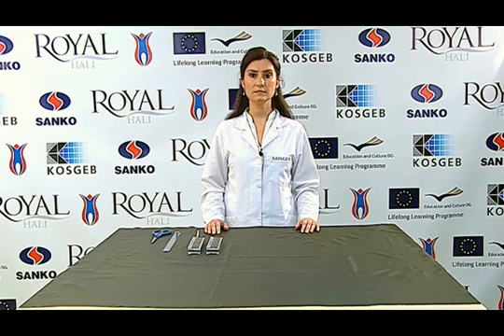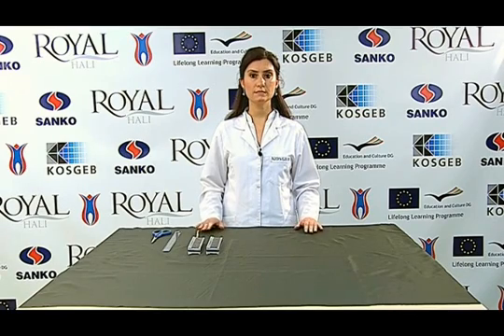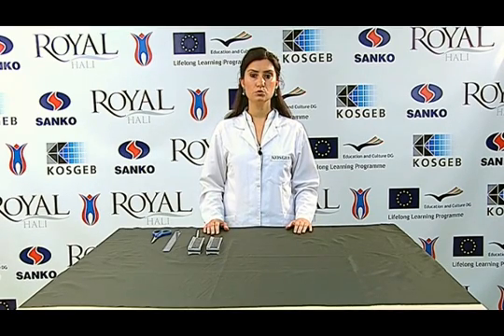First of all, test samples are conditioned under standard atmospheric conditions for 24 hours. The conditioned samples are spread on a flat surface and thus the specimen preparation begins.